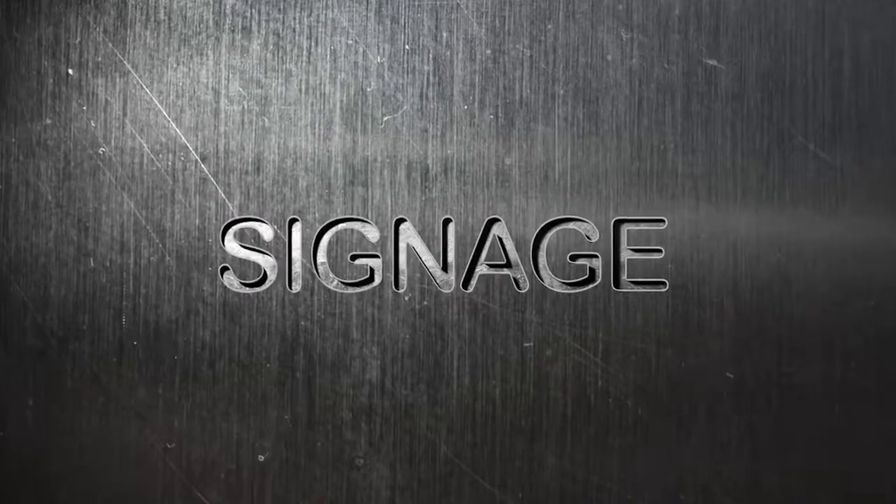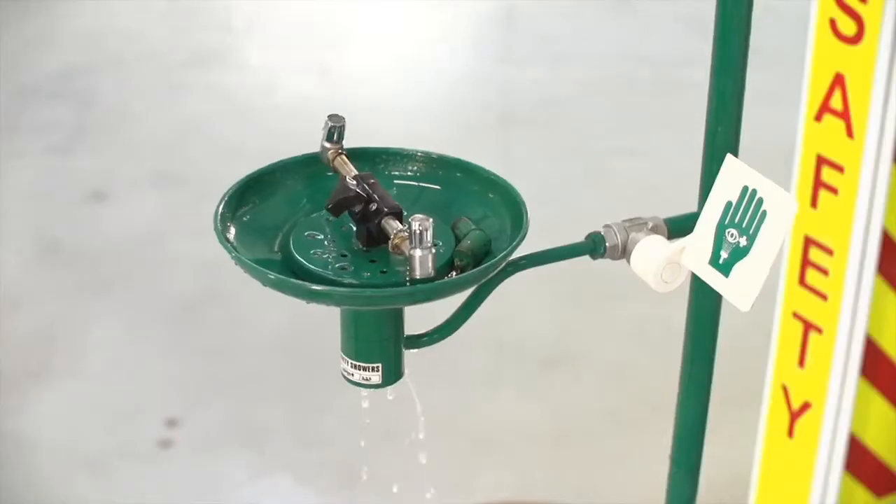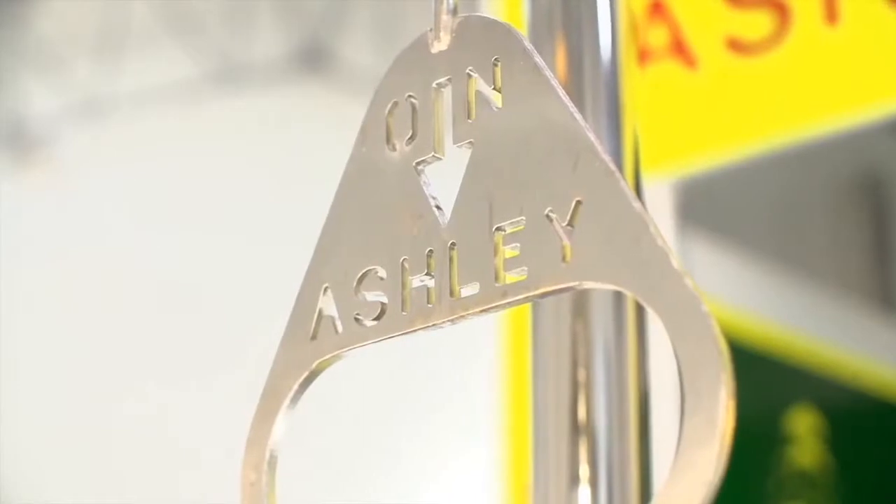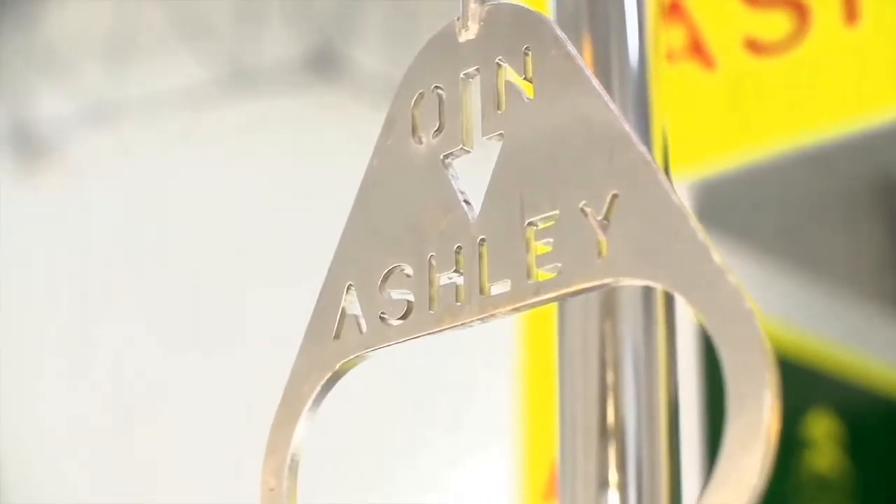Signage. Stickered signage can fade and peel off, deteriorating the look of the shower and even confusing the user as to where the activation points are. Ashley's signage is laser cut into the steel itself.